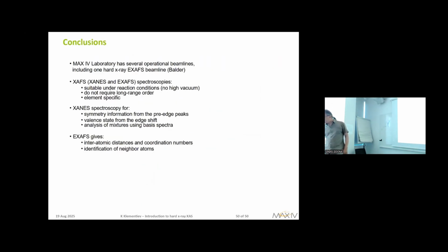All right, I think I conclude here. And I showed you briefly the beamlines of MAX IV, including Balder. And I talked about absorption spectroscopy, showed a few examples in XANES and EXAFS. Both are suitable for reaction conditions because at hard X-rays we don't need vacuum.